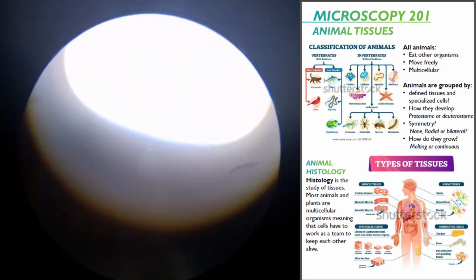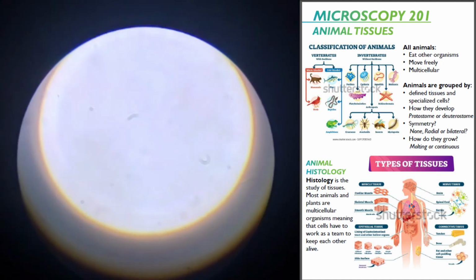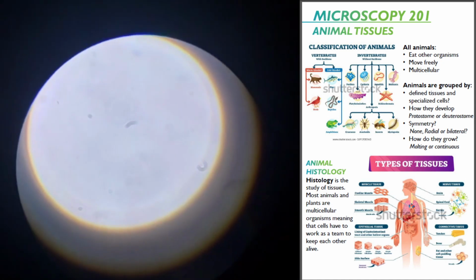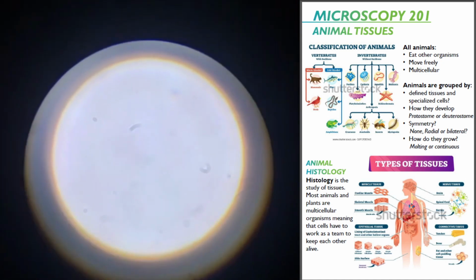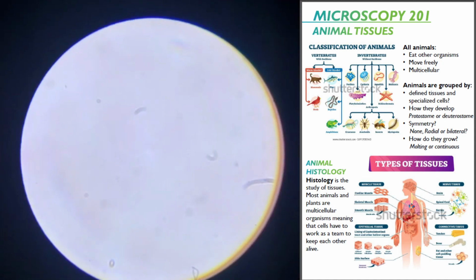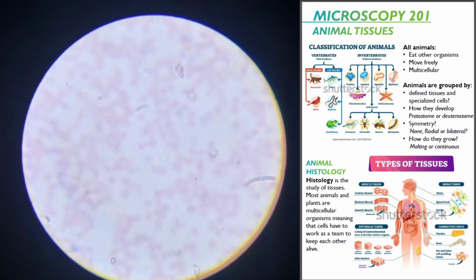They're about 7 to 8 micrometers. Microns. Oh boy. Hope I can get my image back. Oh yeah, there we go. Great. Boom. Oh, it was there. And gone. In there. And gone.